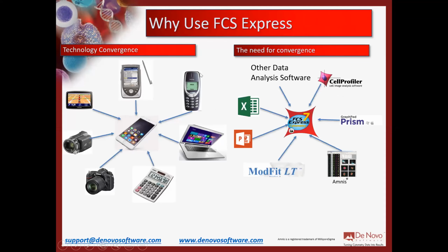So to get started here, I know some people have probably never used FCS Express. Maybe some people have used it for a long time and they're just coming back to get a little bit of information. But I always like to start with: why use the software? Why are there so many people moving away from other tools on the market? We know there are other software packages out there, from different companies, from BD, from Cytoflex, from Cytobank.